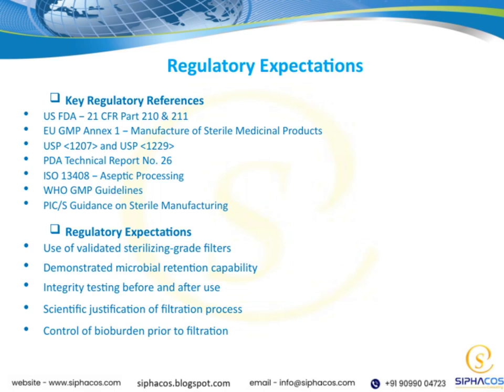We must use filters that are validated for sterilization. This means demonstrating their microbial retention capability, that they effectively remove microbes from the product. We also need to conduct integrity testing both before and after filtration to confirm the filter's performance at each step. This is crucial to ensure the process remains robust and sterile.